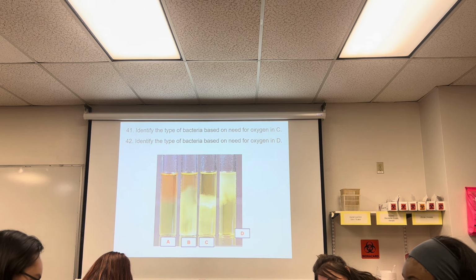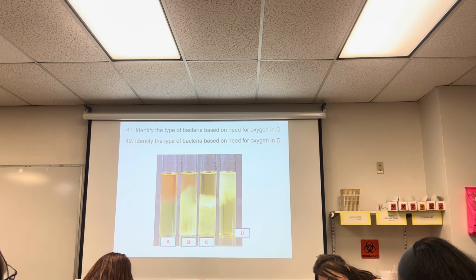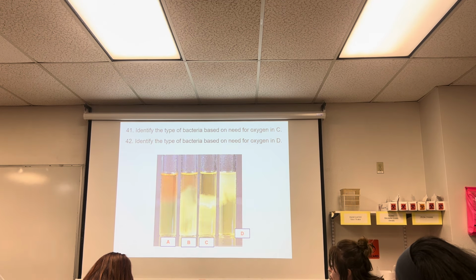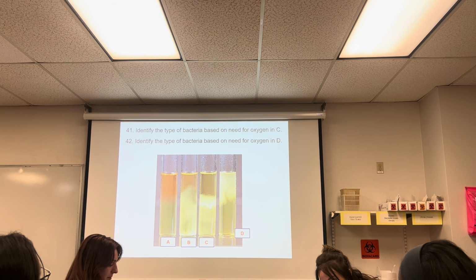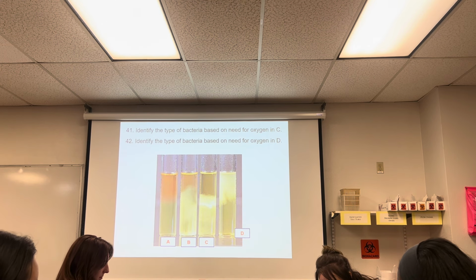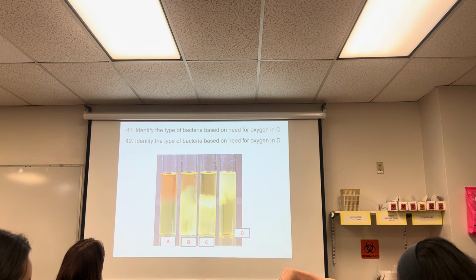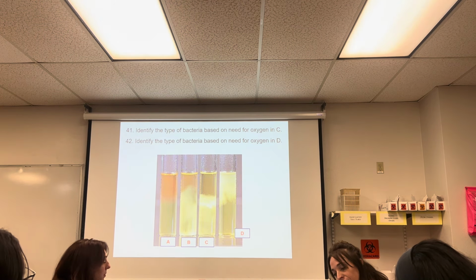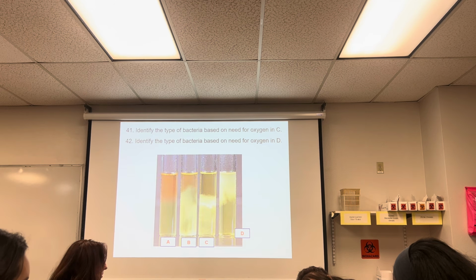So we're looking for the types of organisms based on their need for oxygen. This red area means that there's dissolved oxygen. Nowhere else in that tube except for the red is there oxygen. So if the organism grows at the top of the tube, what type of organism is it? An aerobe. If an organism grows away from the top of the tube, only at the bottom, it's what? An anaerobe. If the organism grows throughout the tube, but there's more growth at the top of the tube, what is it?